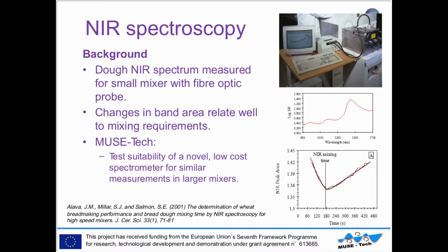So within MUSE-Tech, we wanted to take this a stage further and to see whether we could use the novel low-cost spectrometer that's been built in the device to make similar measurements, and whether we could scale this up to work with larger mixers.